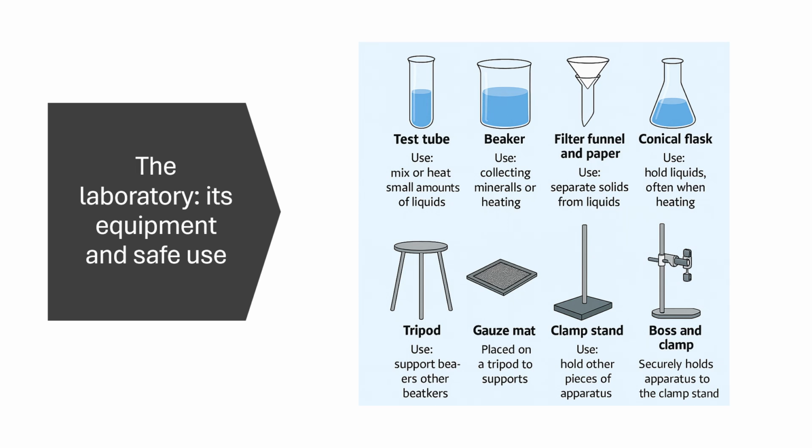Next time you are in the lab, have a look at how many types of beakers you have. Their volumes are different. If you are trying to measure 100 milliliters, you had better use a 100 milliliter beaker.